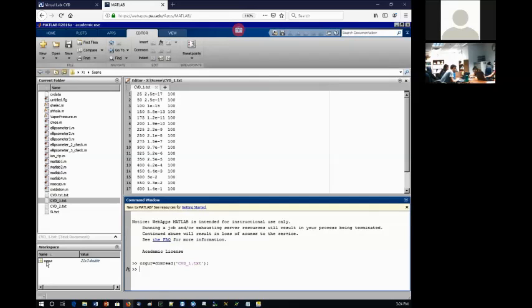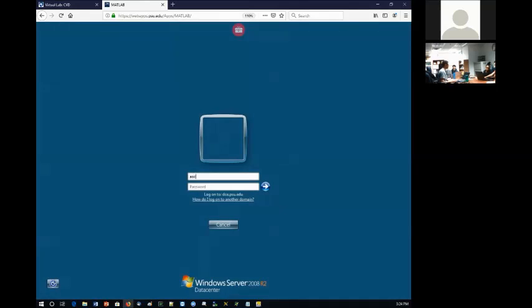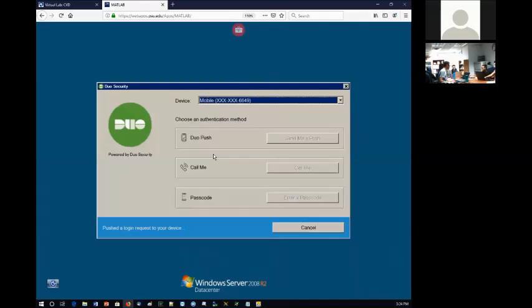Okay, this is me out. I did that. Yeah, but you see, I don't have it. It kicked me out of the server for a second. I'm back. After I hit enter, what happens? I didn't get the area.